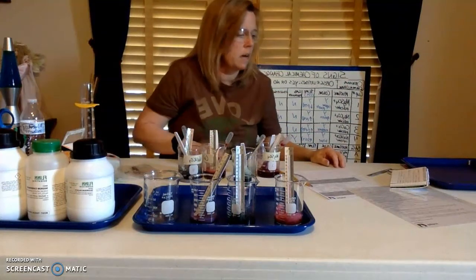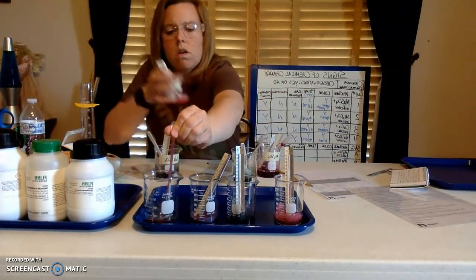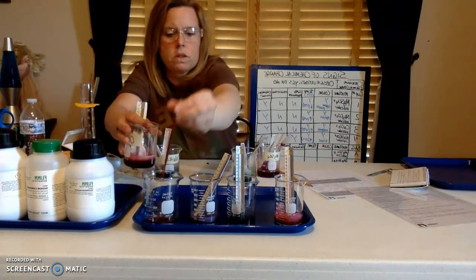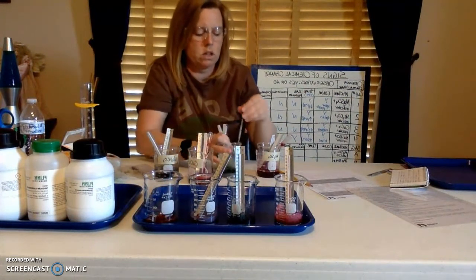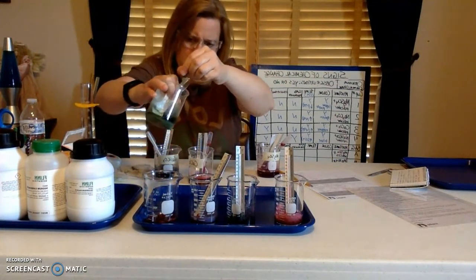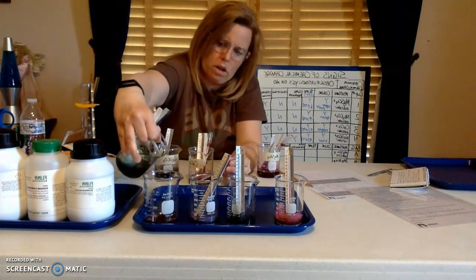And then lastly, I'm going to put calcium chloride in here. This one's a lot easier to move. And we're going to mix this guy, sodium carbonate. This one's a little bit harder. So again, this is a little bit different. I'm doing 2 different ones. I have plenty of solution in there. I'm just going to pour it because I'm impatient.